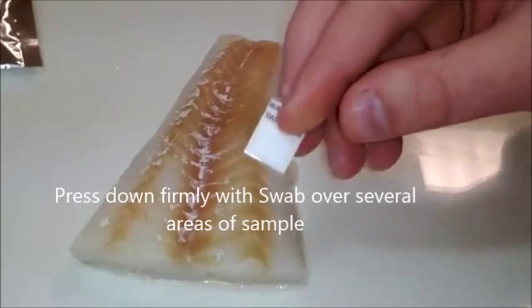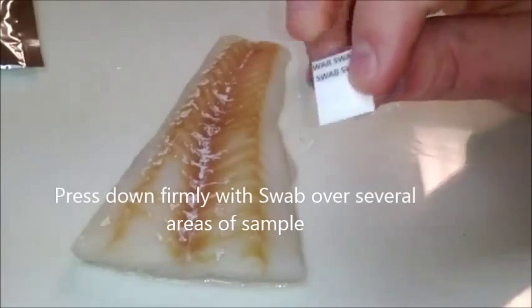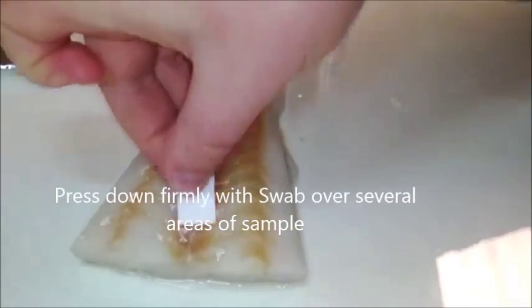Firmly swab the surface of the fish with the square opening of the detector labeled 'swab' in several areas.